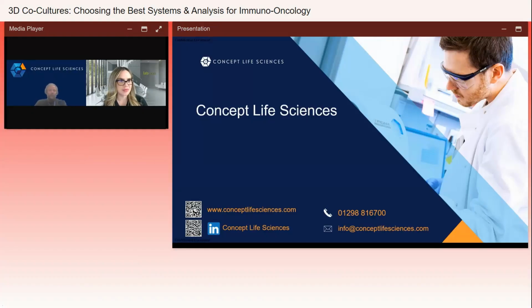And I'd say some of these things we've been culturing for long periods of time. This is one of the reasons why I've already tried to ask the question of, can we put primary macrophages in there to kind of support that as a potential switch for us, because that's going to become important for us. But as a quick test to make sure that all your cells are working together, THP1 is obviously a cheap solution to that, and we've had no issues there. It's just that, yeah, I'm well aware that they're probably going to be more on the pro-inflammatory side.